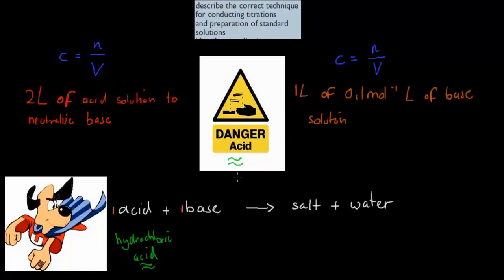So what could you do to decide if it's safe or not? You want to go in, but you might not want to be burned by a pH of 1.0. So what you could do is grab some of that sample, collect the hydrochloric acid in maybe a bucket, and then head back to school and do your titration. Right? So you can do a titration to figure out the actual concentration of that unknown hydrochloric acid.